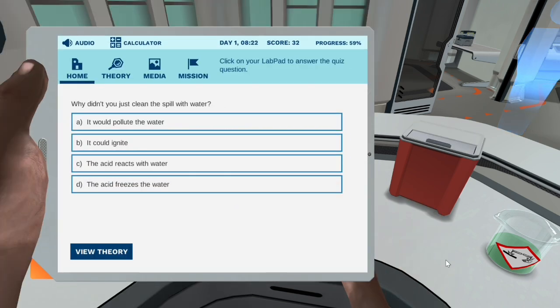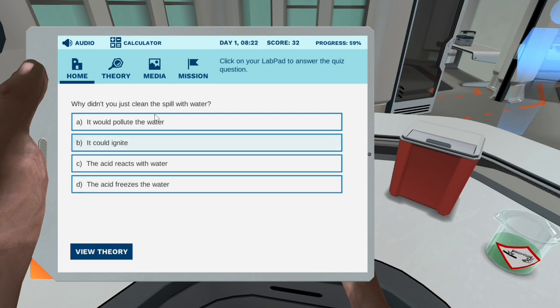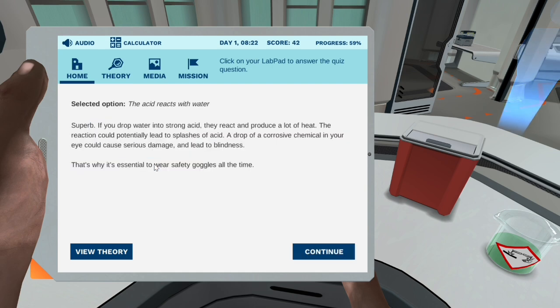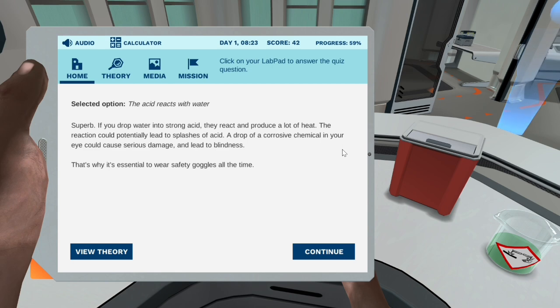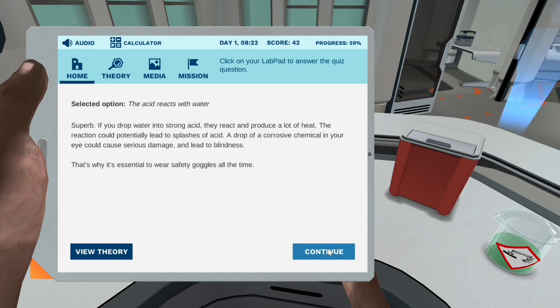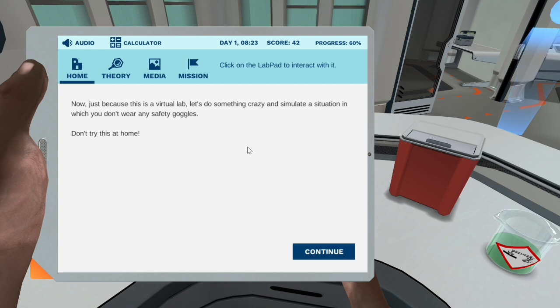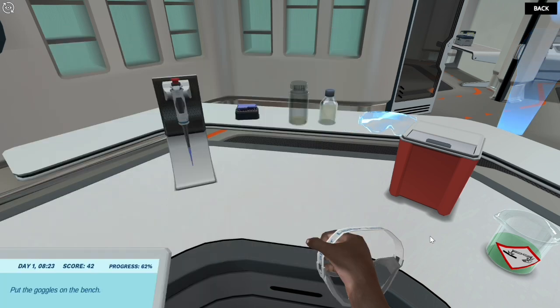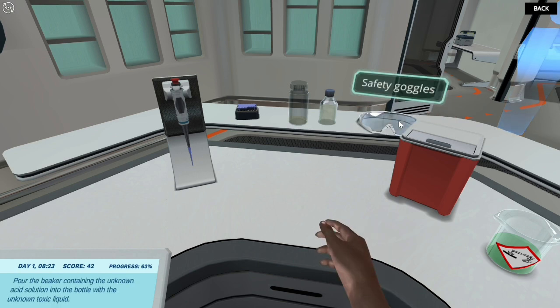Why didn't you just clean the spill with water? Option A: it would pollute the water. Option B: it could ignite. Option C: the acid reacts with water. Option D: the acid freezes the water. Superb! If you drop water into strong acid, they react and produce a lot of heat — the reaction could potentially lead to splashes of acid. A drop of a corrosive chemical in your eye could cause serious damage and lead to blindness. That's why it's essential to wear safety goggles all the time. Now, just because this is a virtual lab, let's simulate a situation in which you don't wear any safety goggles — don't try this at home. Put the goggles on the bench and pour the beaker containing the unknown acid solution into the bottle with the unknown toxic liquid. Like I said, don't ever try this at home.